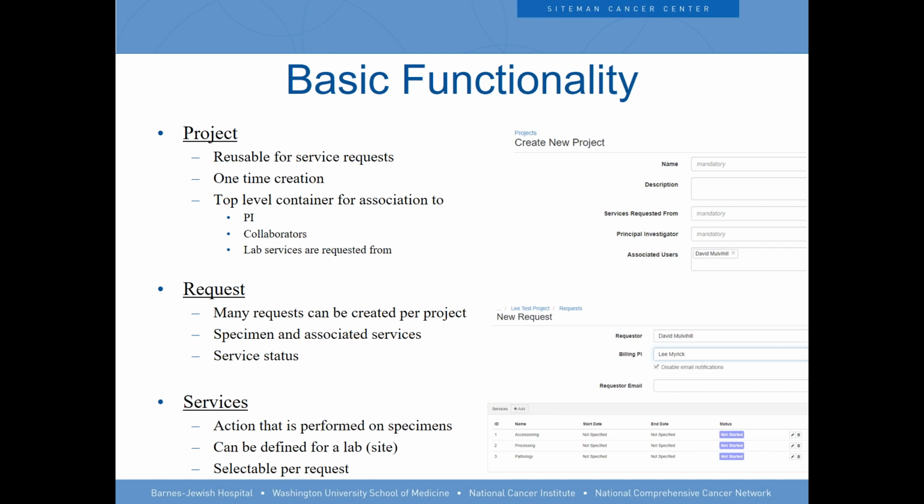Yeah. So there can be a request against external specimens. That was one of our main functionalities as well. It doesn't happen too often. What we see is the main users that are placing requests already have specimens in OpenSpecimen, but there is nothing that stops somebody from loading an external list of specimens that need to be processed.